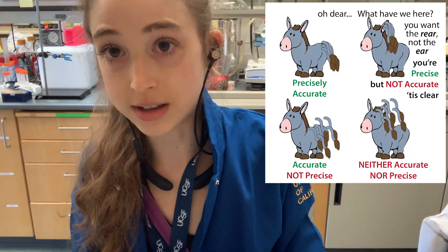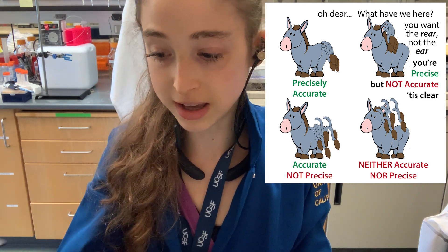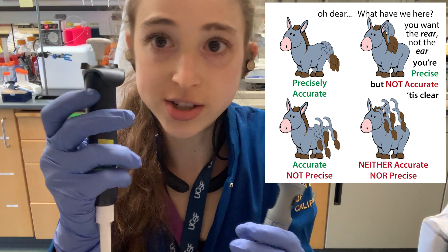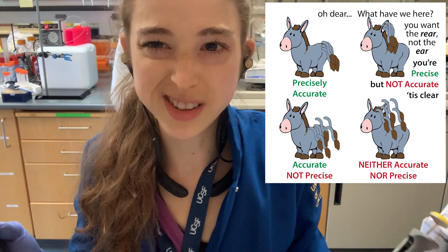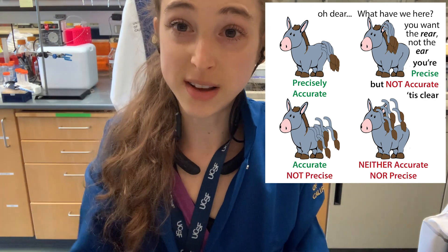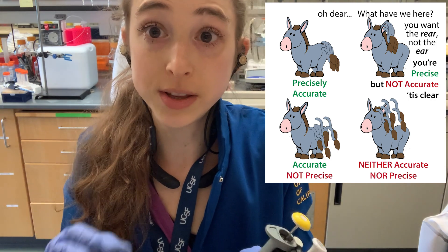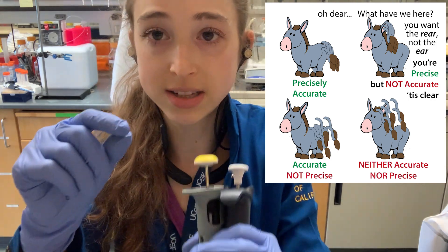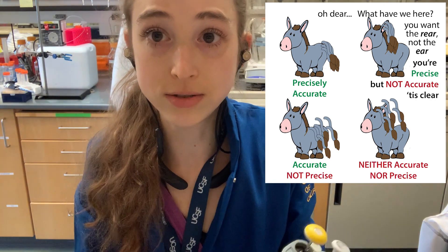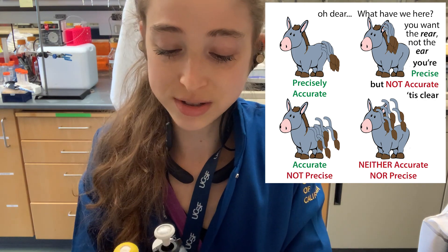So: choose the pipette with the lowest volume that will pipette your sample — you're going to have the most accuracy and also more precision. Precision is like how many digits after the decimal, that sort of thing. Using the pin-the-tail-on-the-donkey analogy: accuracy is whether you're actually on the donkey's butt, and precision is how close all of the different tails are around that donkey's butt.